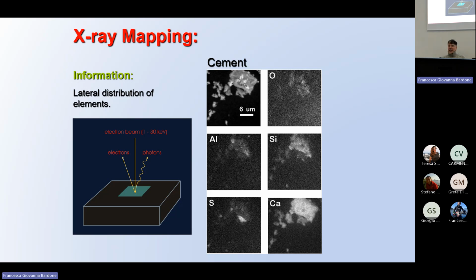But gold interacts very strongly with X-rays and absorbs a lot. The advantage of carbon is that it is a low Z element, so the absorption is less, but you still have an interaction. You have modified the surface, and you could have some absorption.